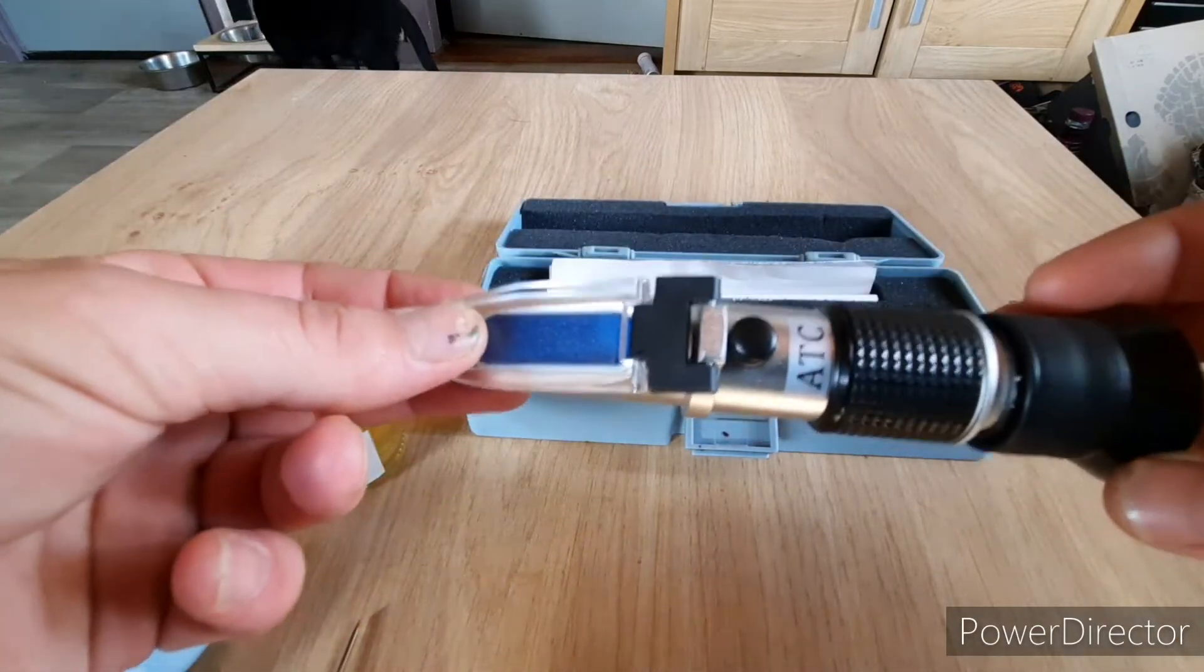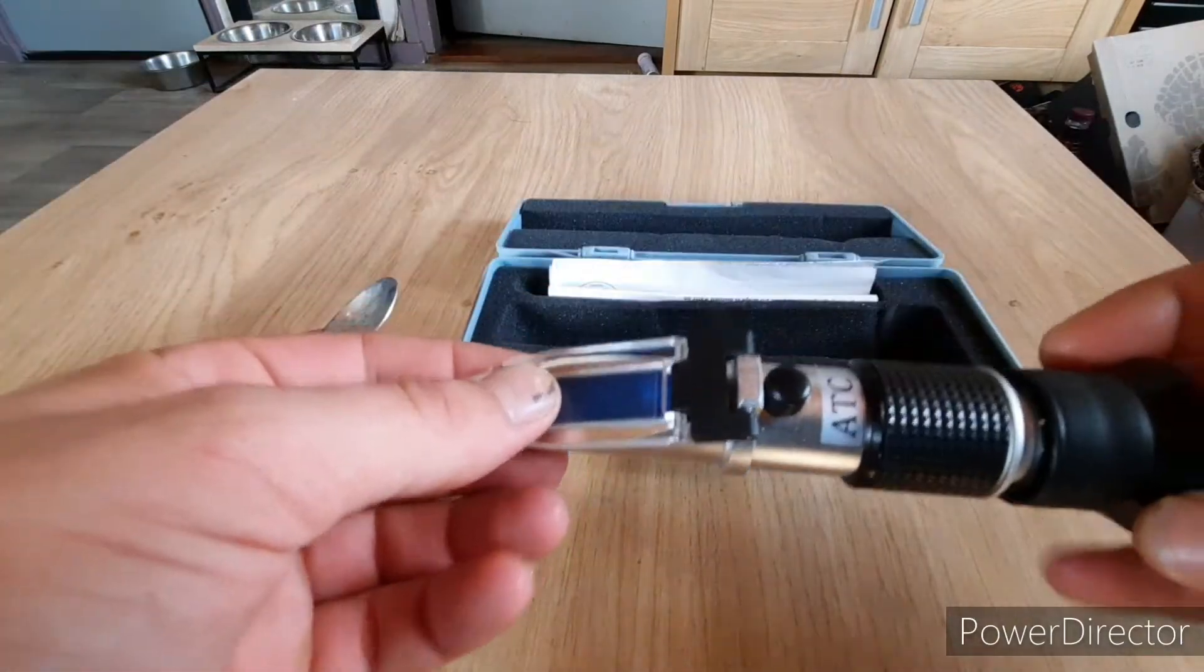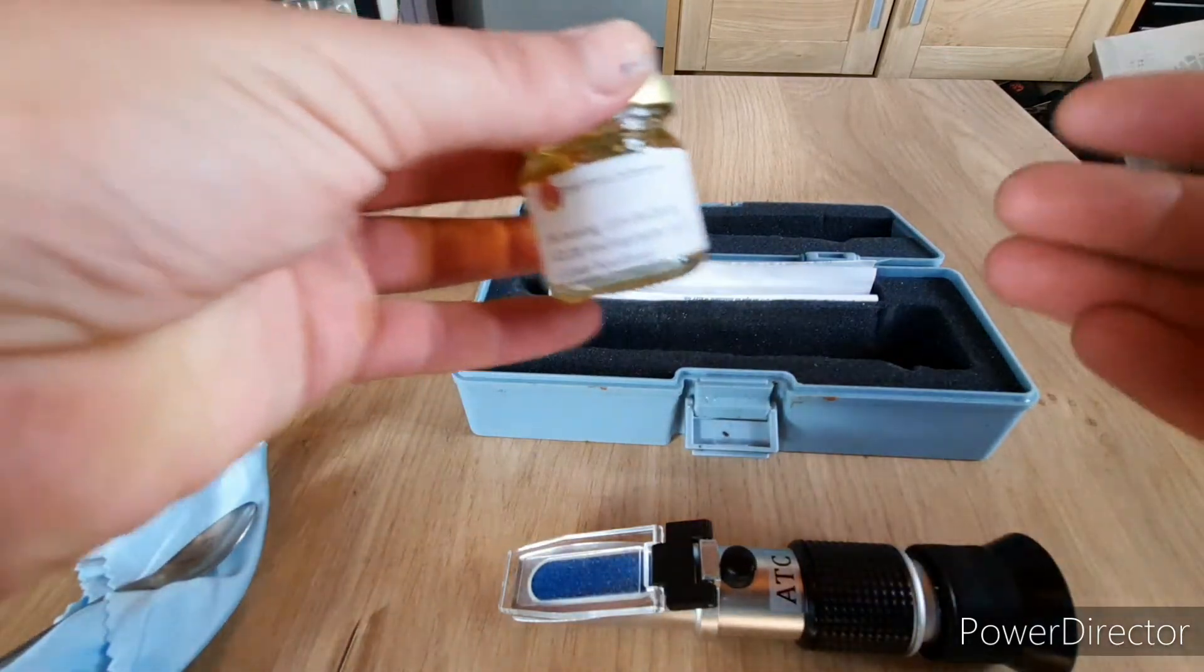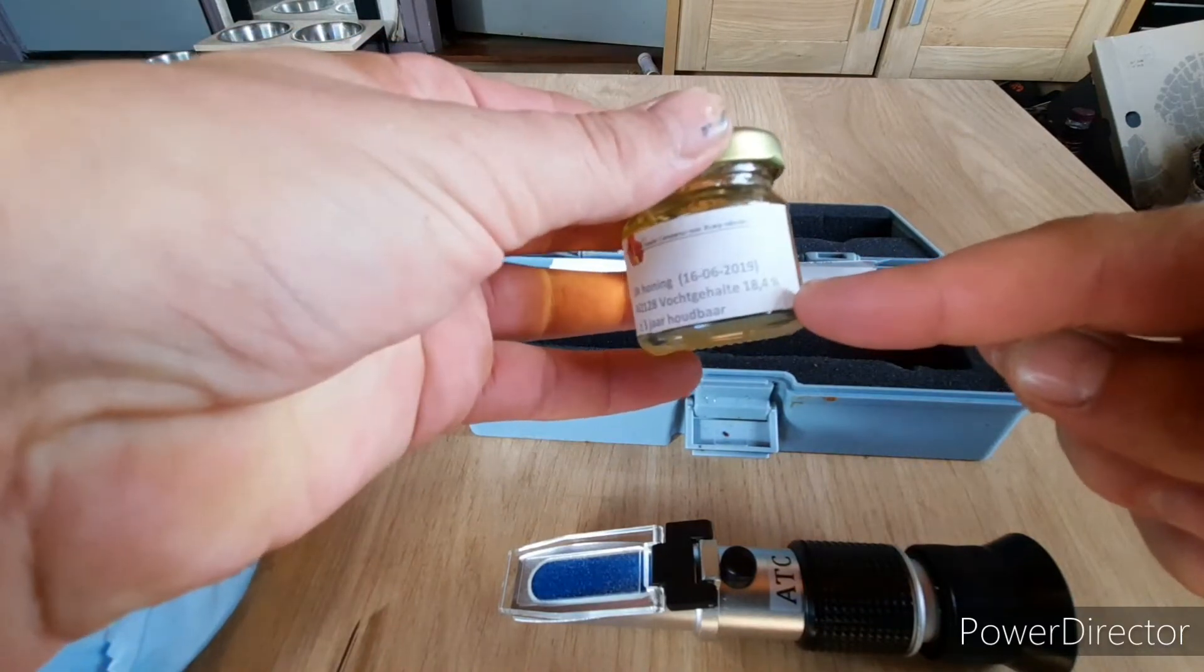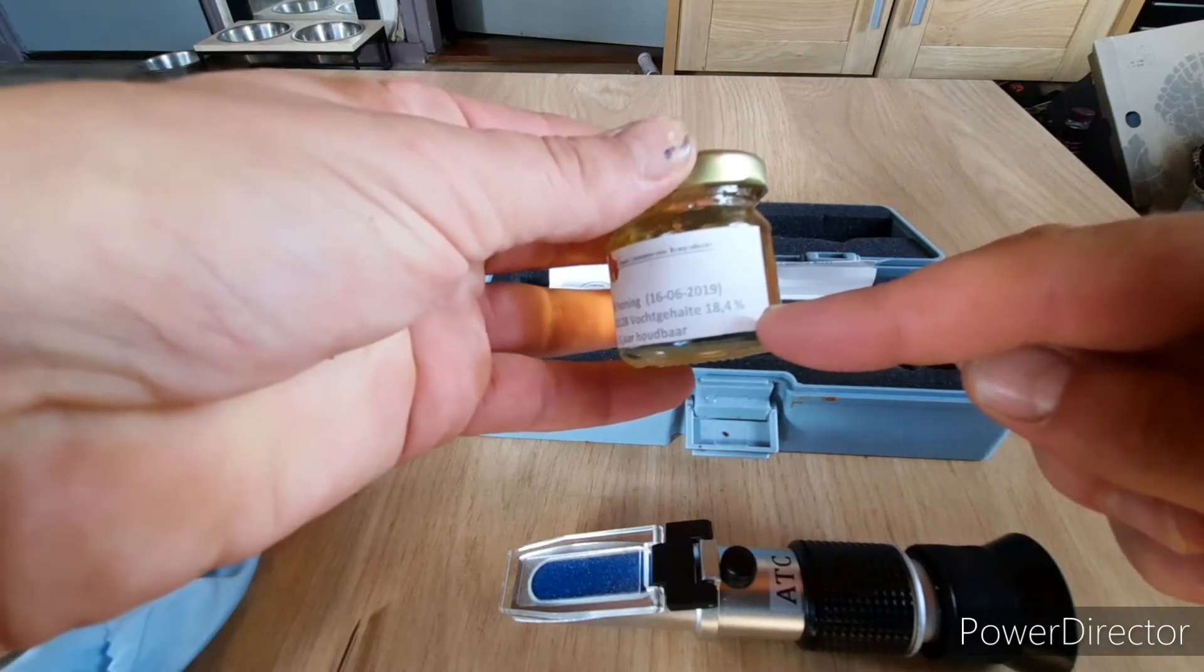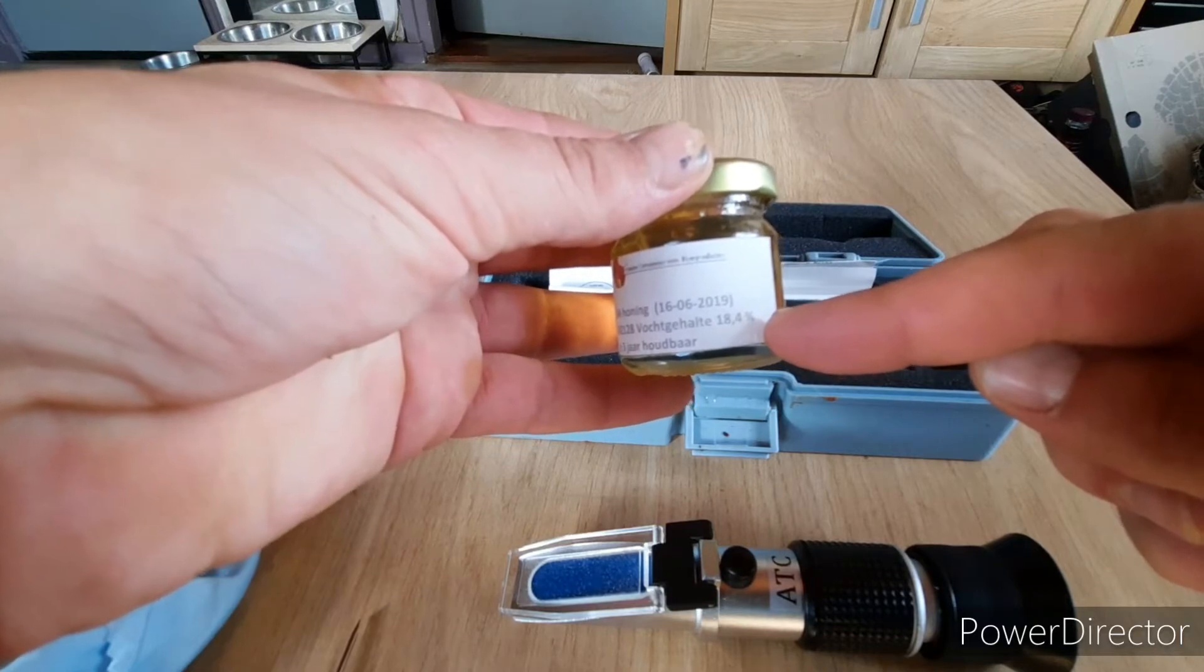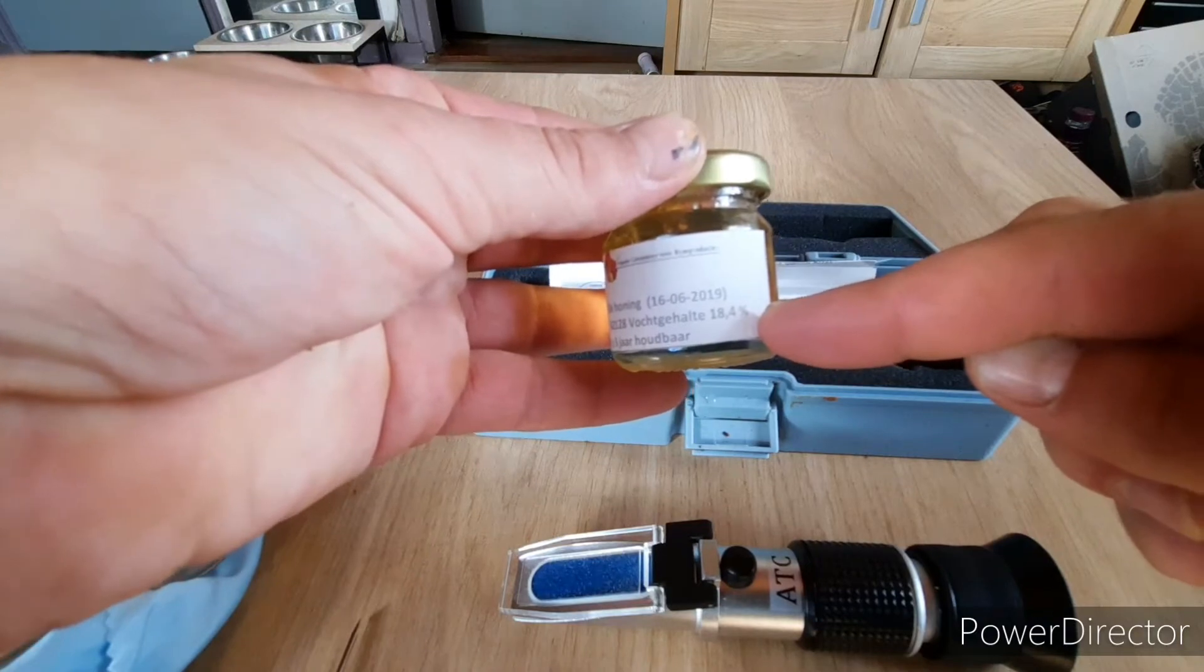Well first we've got to calibrate. We've got some calibration honey which is in fact just honey with a known water content. It says water content 18.4 percent, so it is 81.6 percent sugar. It's just honey where the contents is known.